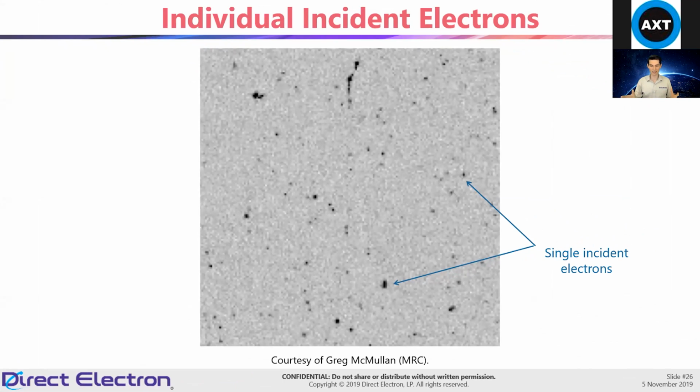So we take a look at individual electron events. This is an image that has inverted contrast. So the electron strikes are in essentially black, and in the background, where nothing is, it is white. And so we can see that there are small events, large events, and streaky events, and this is what you would get from basically a counted frame before you start, after dark subtraction.